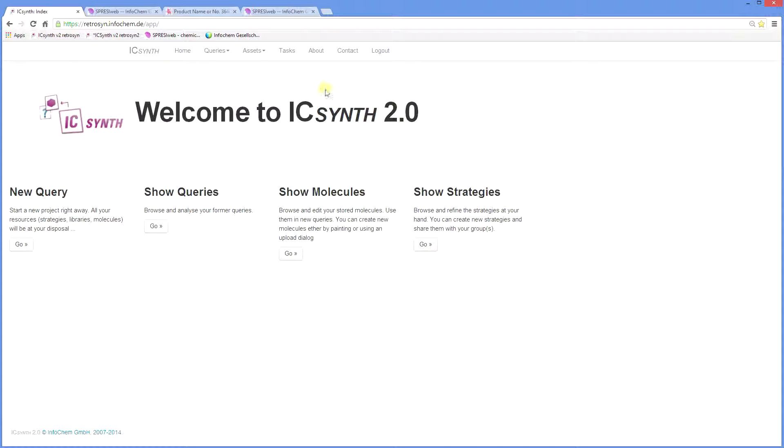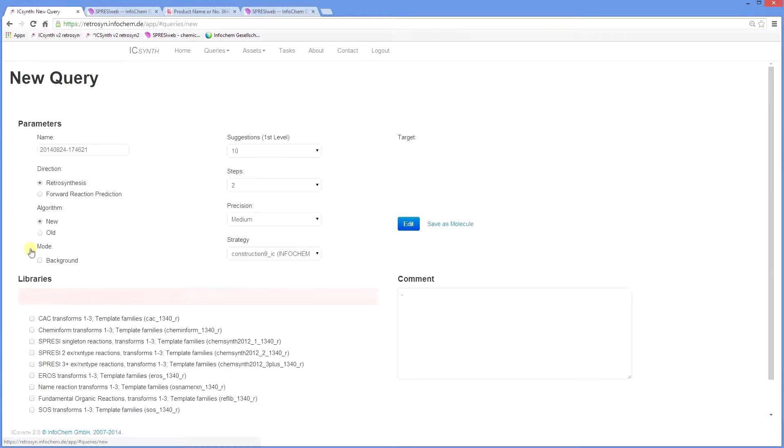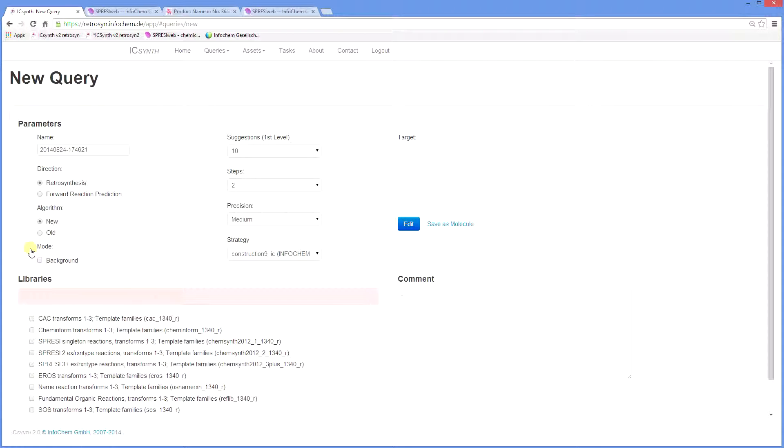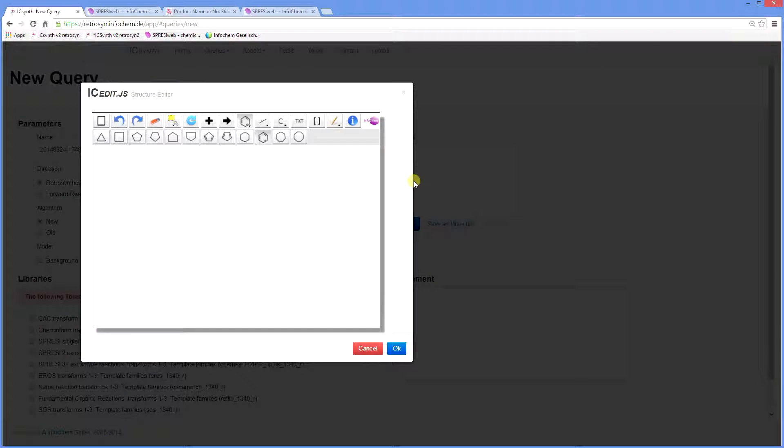Along the top are the menus containing additional options and commands. So to start your new query click here and you are taken to the new query screen where you can draw your target molecule. A single click in the white box takes you to the structure drawing editor.